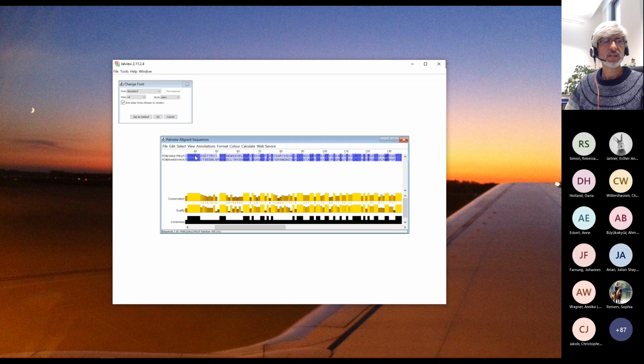In this case, I'm pointing at histidine 41, and you can see that it is also histidine in the human SARS. And if we go to 144, the numbers in the alignment are a bit different, but we are around 140, so the cysteine should be here. There it is. So this is the cysteine 144, and it's also a cysteine in the alignment in the human protein. So the catalytic dyad is conserved in the human protein.